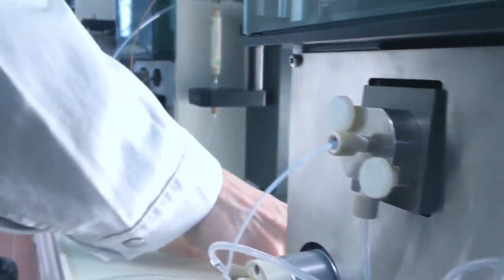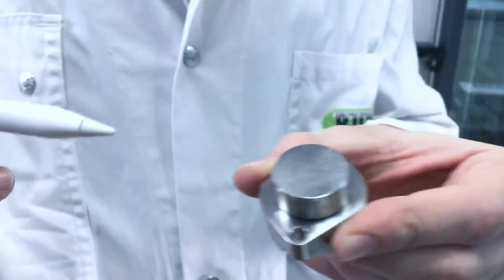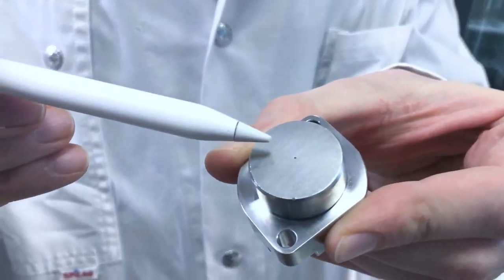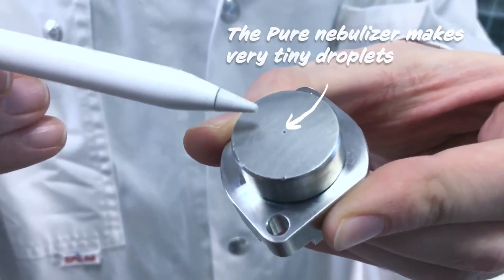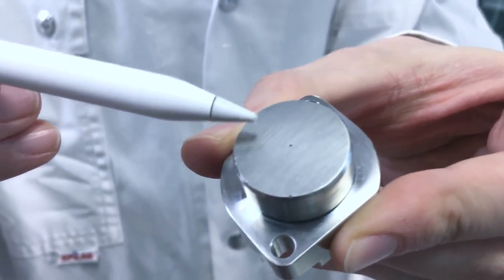Let me show you the nebulizer. Do you see this very small hole here? That's where the nebulizer sprays the tiny droplets. Now these droplets go into a long tube, where the solvents get evaporated.